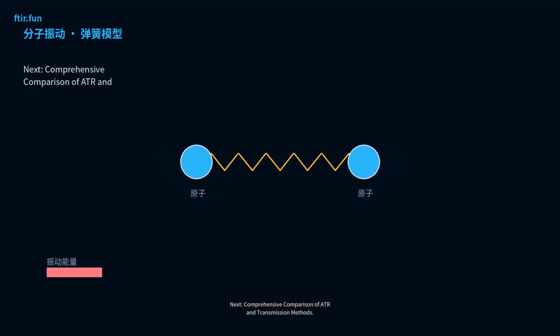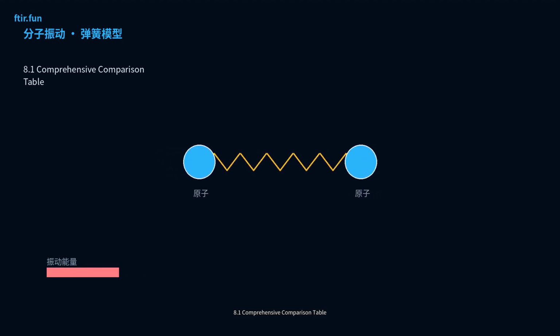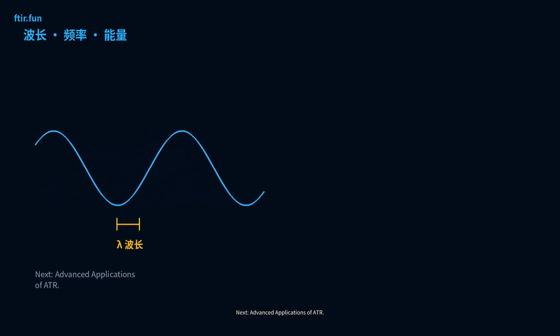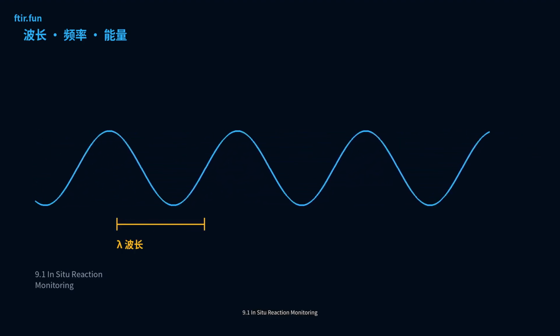Next, comprehensive comparison of ATR and transmission methods. 8.1 Comprehensive comparison table. Table 6: Comprehensive comparison of ATR vs transmission. Next, the applications of ATR. 9.1 In situ reaction monitoring.